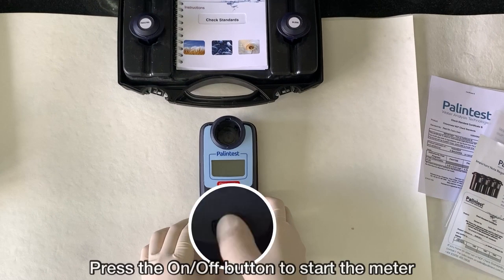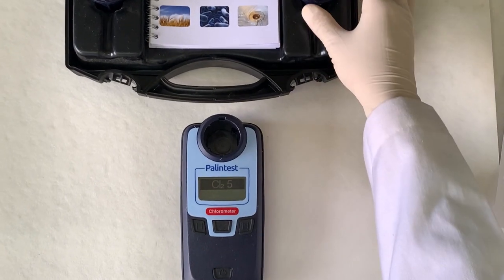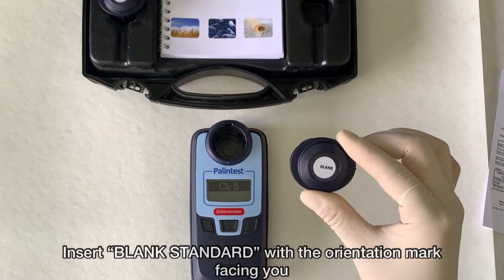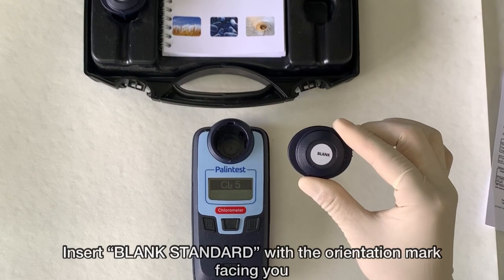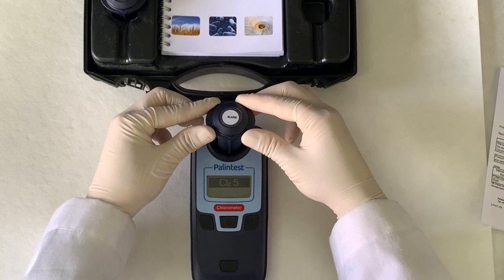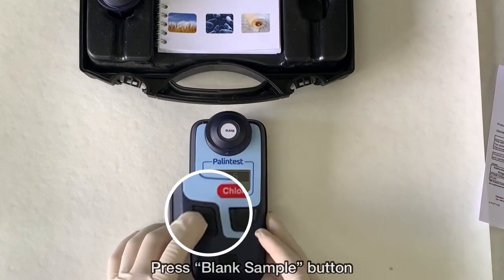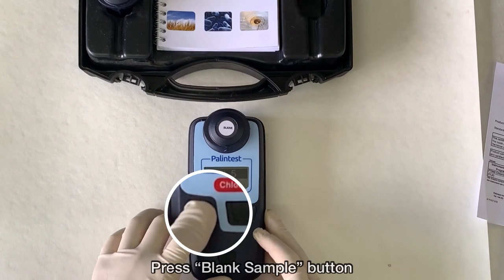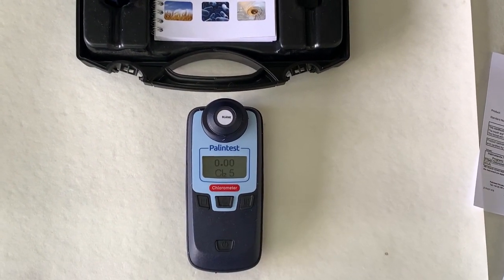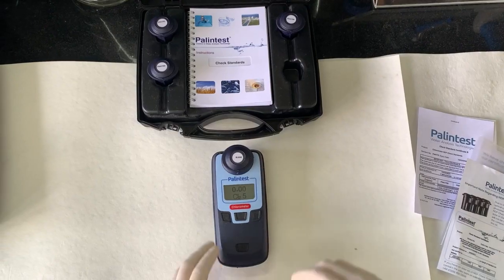Press the on/off button to start the meter. CL25 is displayed on the screen. Set the meter to zero by inserting the blank standard with the orientation mark facing towards you, then press the blank sample button towards the left side of the meter. Zero will be displayed on the screen.